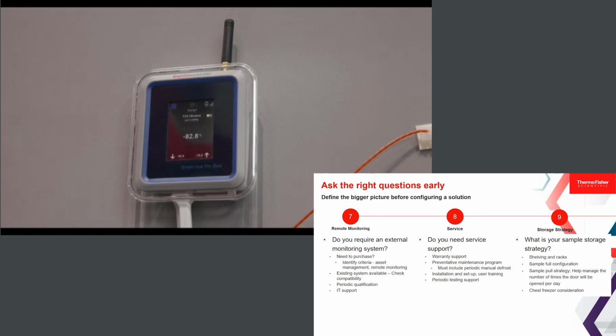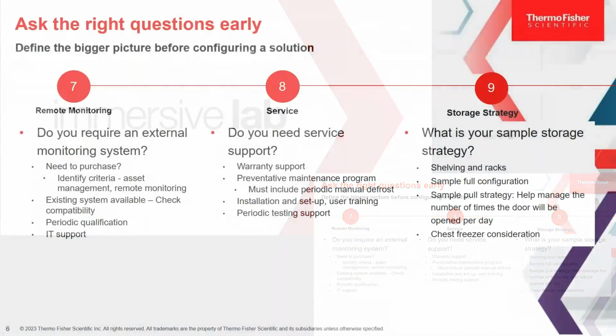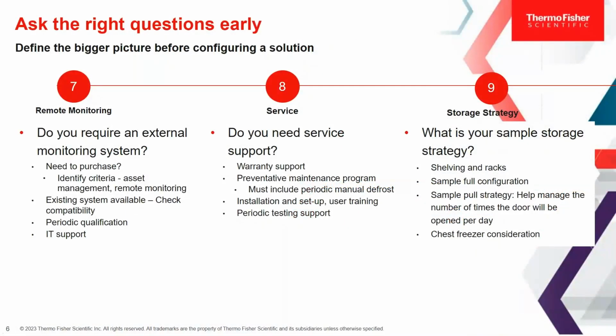Next, we're going to talk about service. So thank you, Danny, for showing us the remote monitoring. That was our SmartView Pro system. That was awesome. So next, you want to talk about service and support.